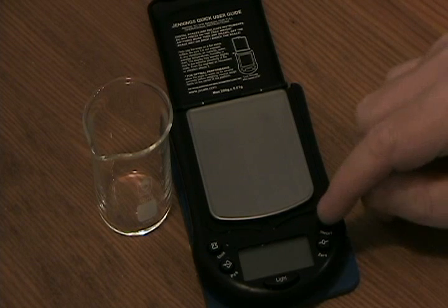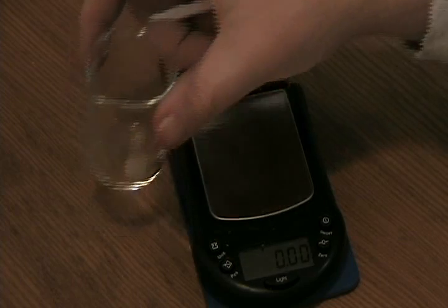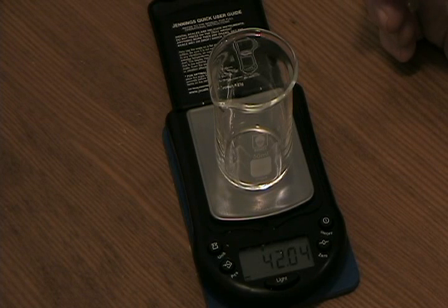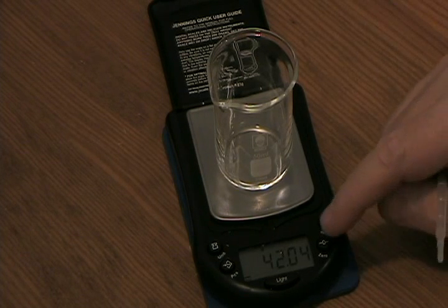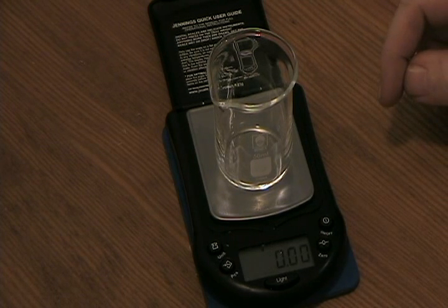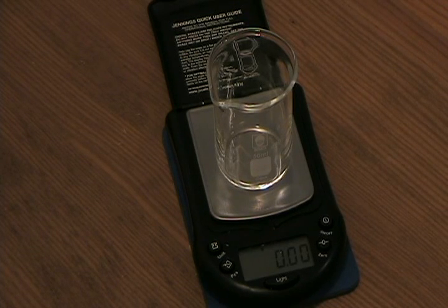Let's count and weigh some drops. We'll turn on the balance and allow it to boot. It comes up reading 0.00 grams. We'll then transfer a small beaker to the balance pan — we find that it weighs 42.04 grams. Now we'll press the zero or tare key, which nets out the balance to 0.00 grams with the weight of the beaker included. Let's start transferring drops of water.